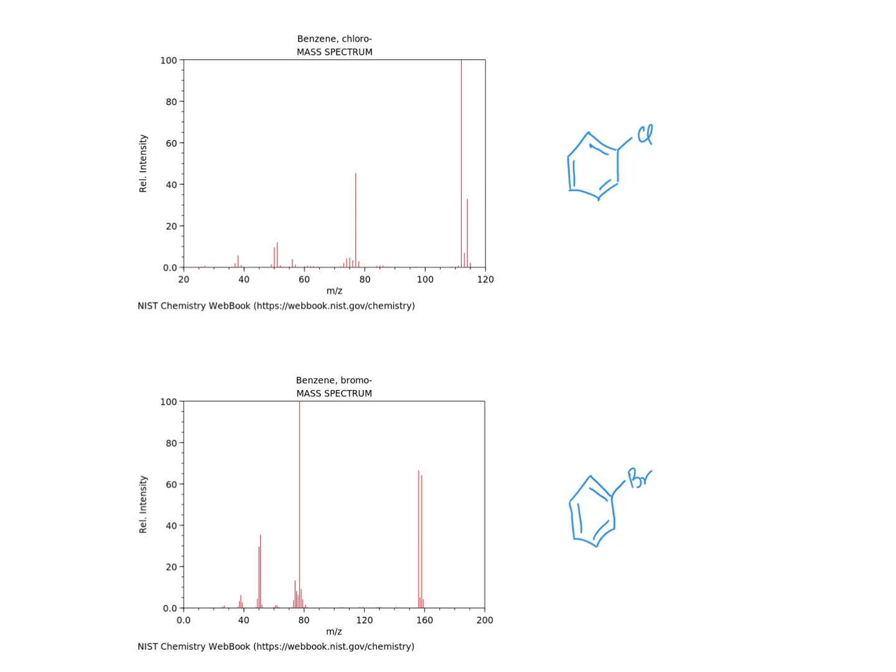Okay, so in this video, we're going to look at mass spectrometry as well as IR spectroscopy, okay? So let's start with some basics of mass spectrometry. When it comes down to it, there are some patterns that I want you to recognize. Those patterns are going to exist for specific halogens. We're just talking about chlorine and bromine, like you see here.